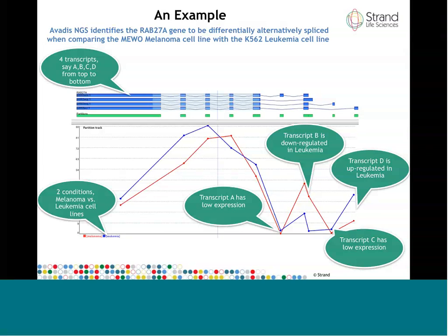So for instance, if you've got reads that are spliced across exons, a read in RNA-Seq could straddle multiple exons, because the gene product, the transcript itself, has introns spliced out, and therefore what is contiguous on the transcript need not be contiguous on the genome when you map it back. So you could have a read that has a part in this exon here and a part in this exon here.